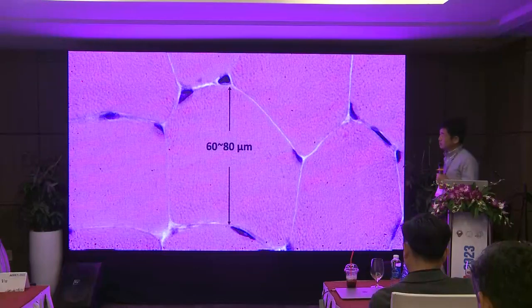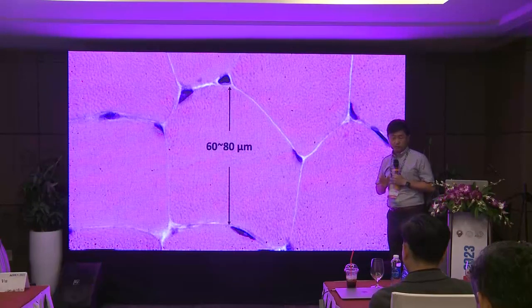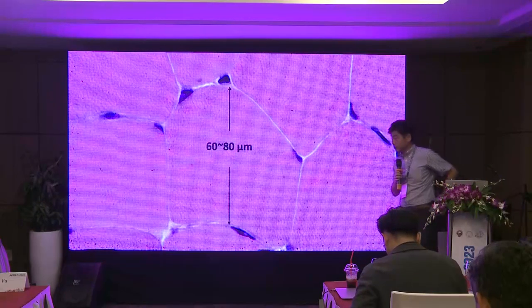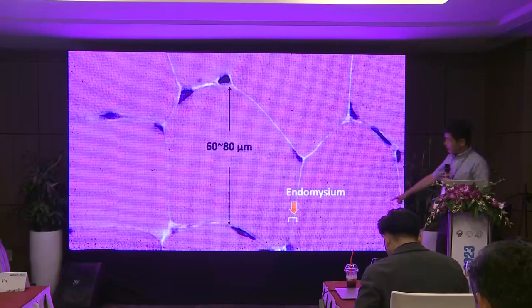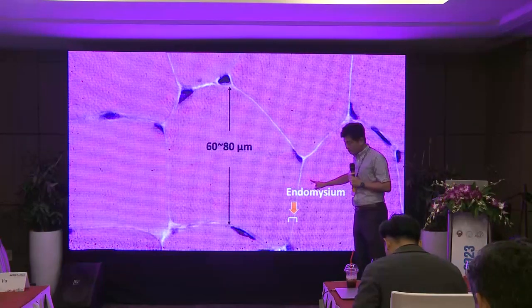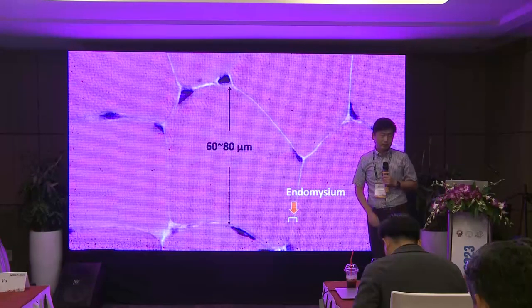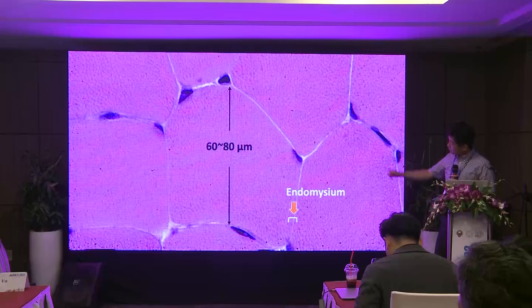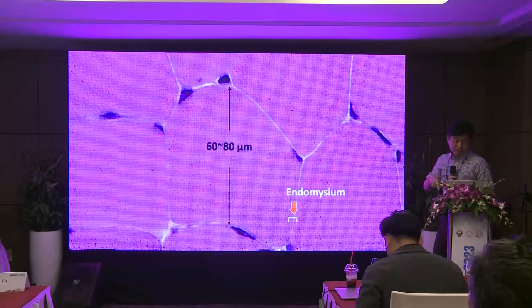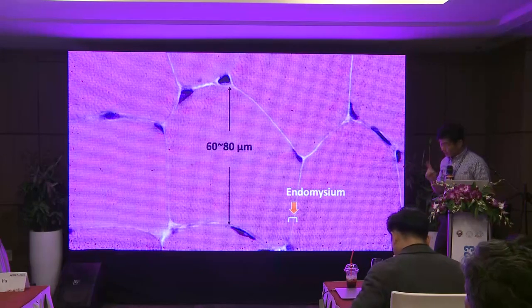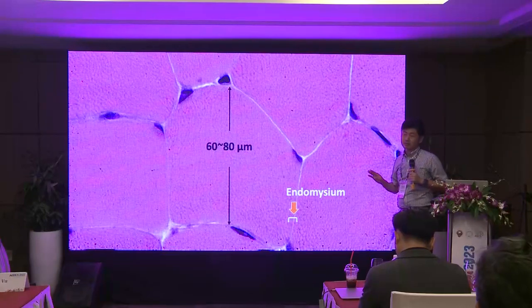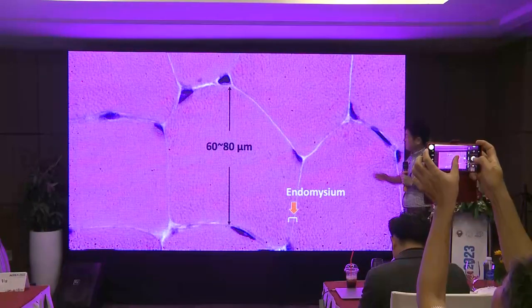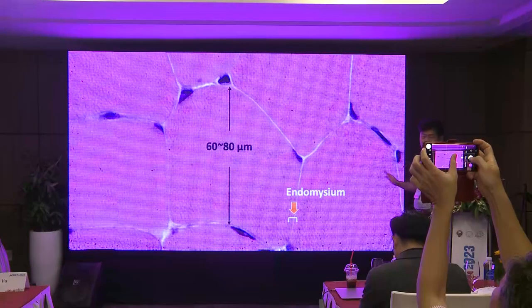This is the magnified version of normal muscle fiber. The fiber size is 60 to 80 microns — if larger than 100 microns in adults, we call it hypertrophic. The space between myofibers is called endomysium. Look at this endomysium — what is present? Nothing — just space. This is very important: in the endomysium, normally there is nothing. Myonuclei are present at the periphery in normal muscle.